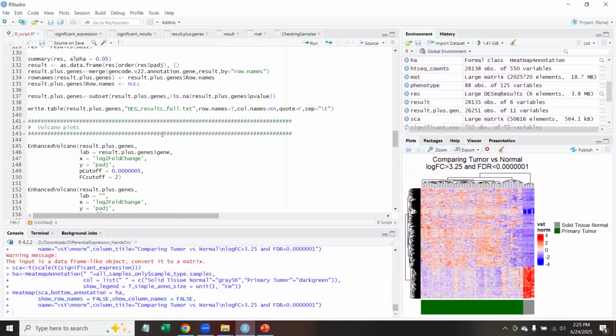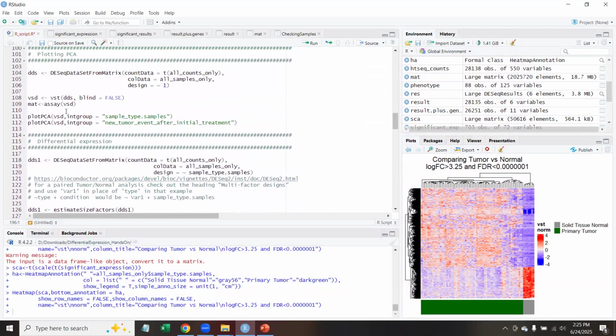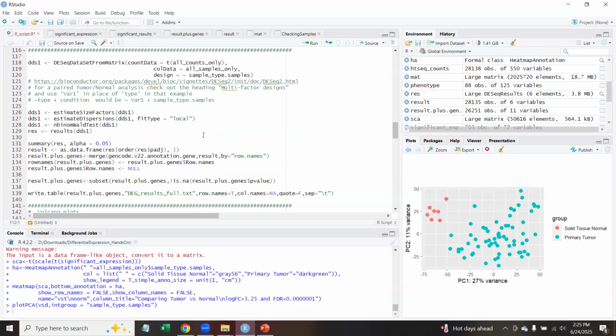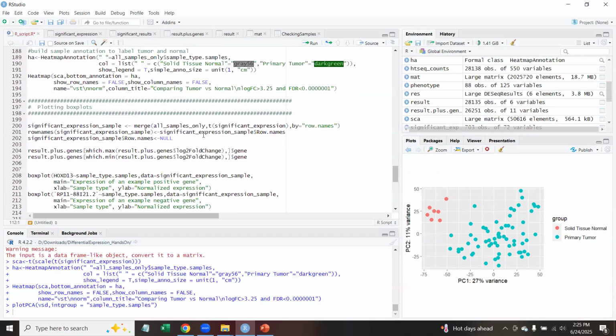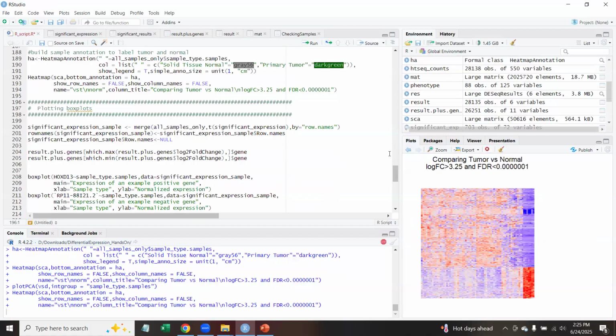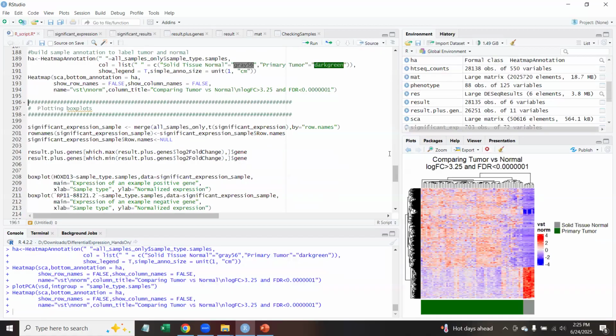Going back to our PCA plot, I would guess that those tumors that clustered in their own cluster, apart from the other tumors, are these that exist closer to our normal samples. We could check that out, but that's what I would suspect. There is a population of tumors here that are slightly more normal than tumor.